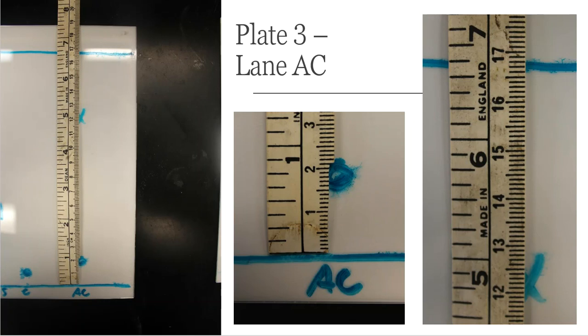And then finally, plate 3, which was lane AC. And AC was the Tylenol. All right, so the Tylenol also made a spot that was pretty low. So I zoomed in on this area, and that's what you're seeing here, so that way you can read the ruler a little bit better. And then here is the mobile phase line, and that's over here to the side.